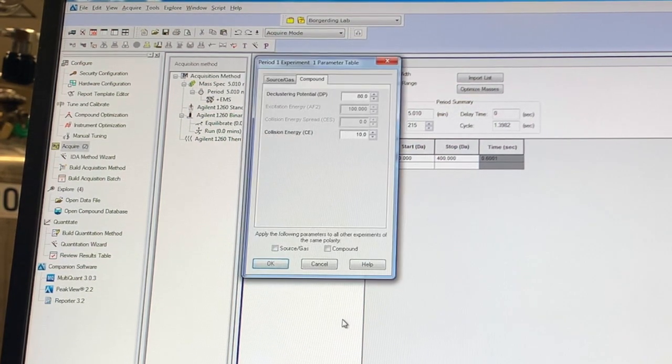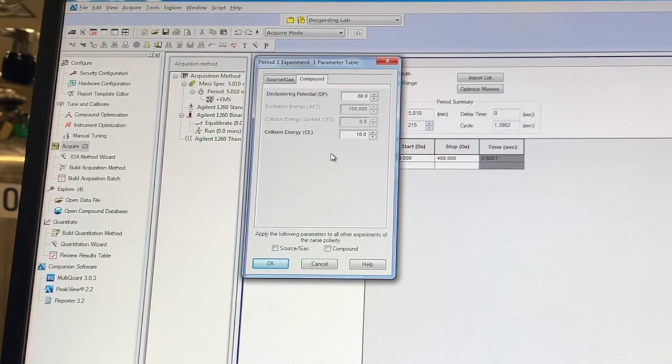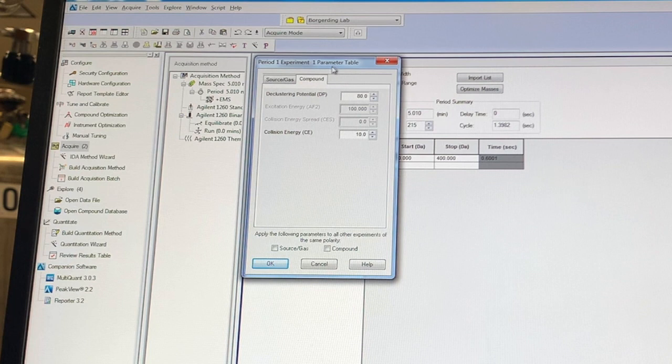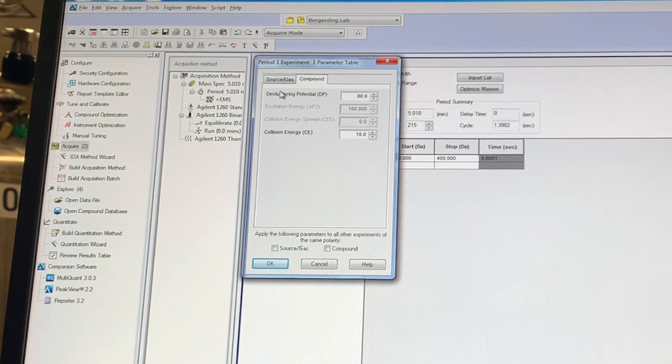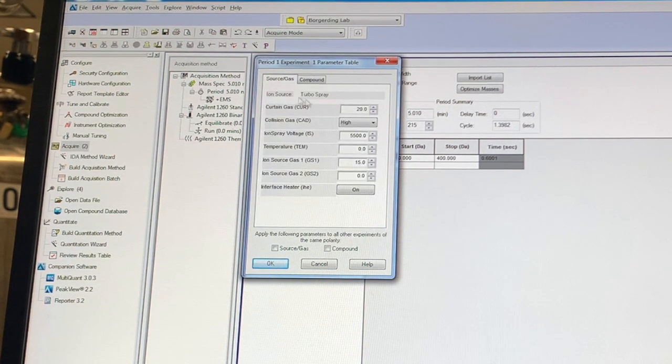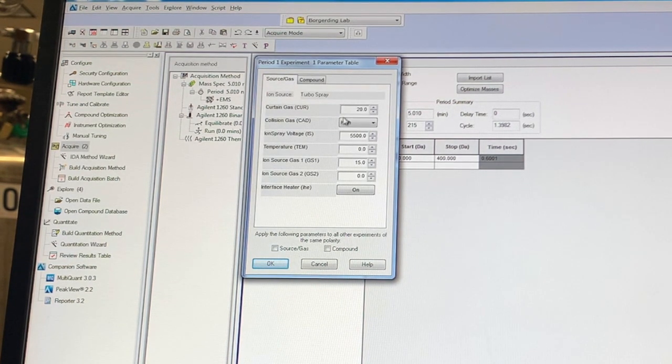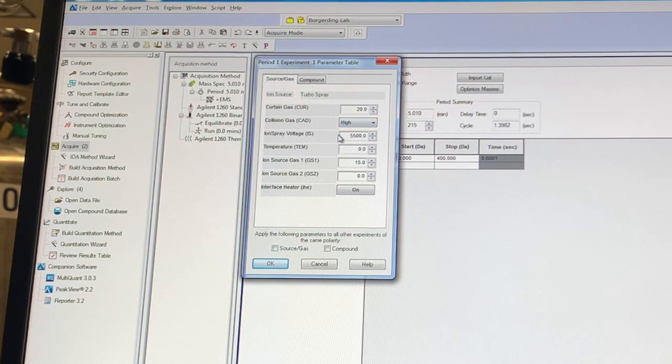Now that's not all. We also have these further parameters, declustering potential, collision energy, and then several parameters involving the source.